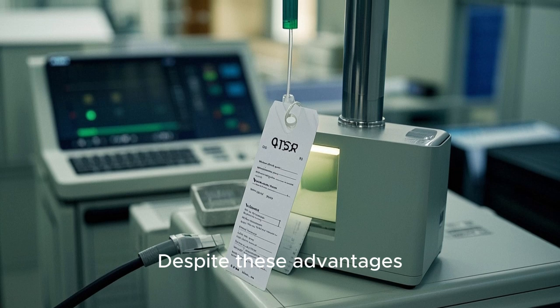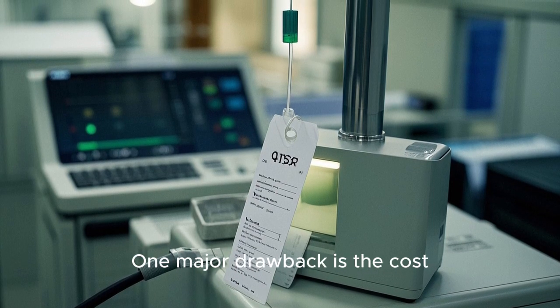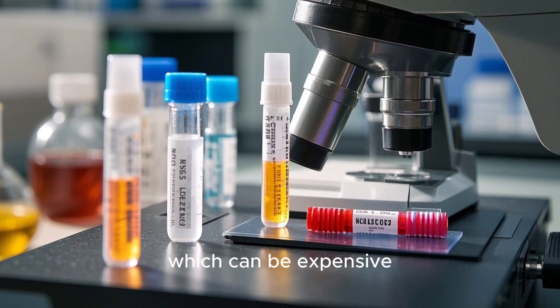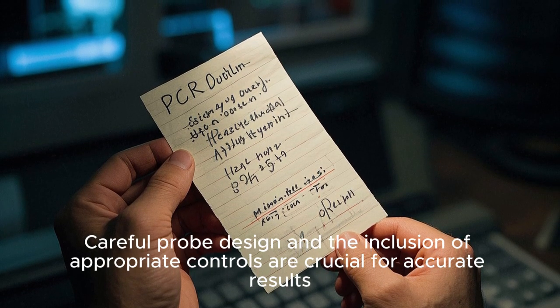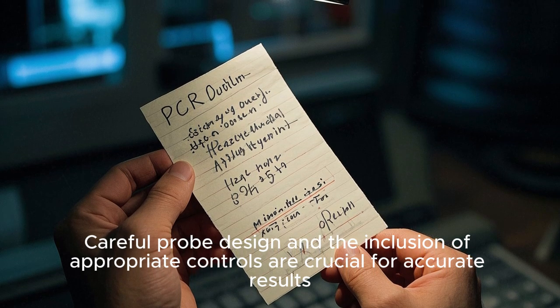Despite these advantages, qPCR does have some limitations. One major drawback is the cost. qPCR requires specialized equipment and reagents, which can be expensive. Another limitation is the complexity of the technique. Careful probe design and the inclusion of appropriate controls are crucial for accurate results.